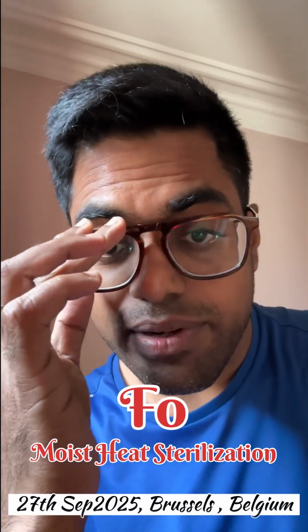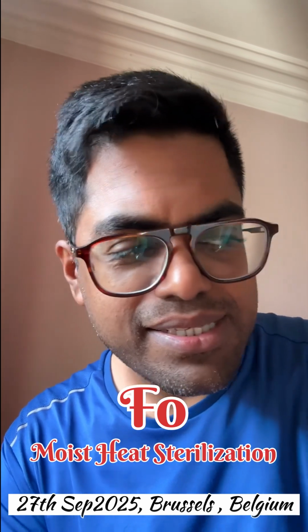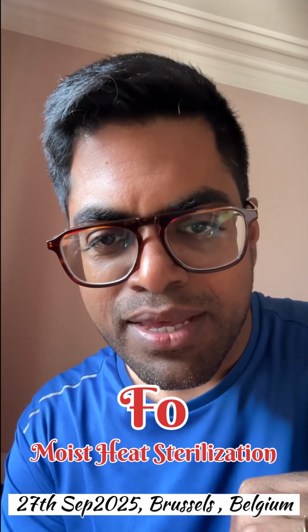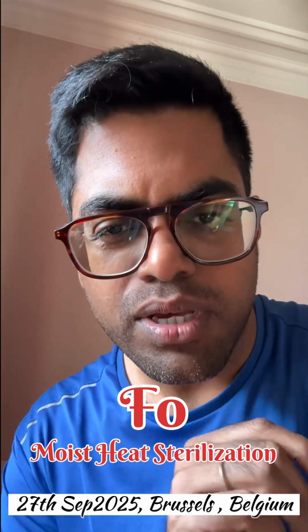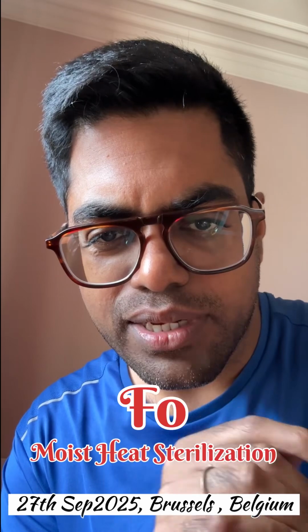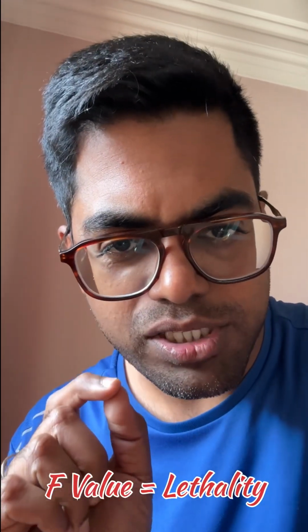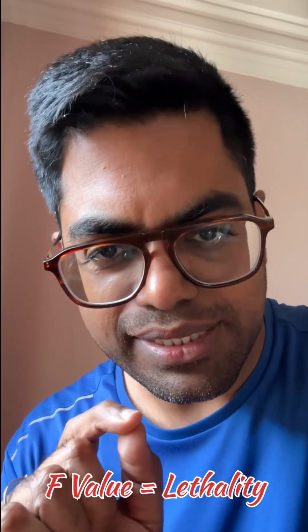Hello friends, today I will talk about the most interesting topic in moist heat sterilization technology, that is called F value. Now you are amused, what does it mean by F value? We listen F0 value. F is a terminology which represents the lethality.